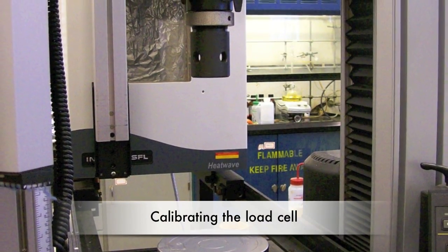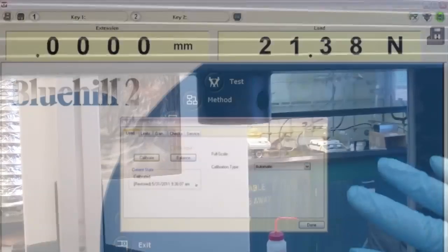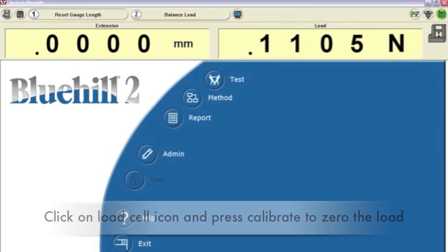Next, you need to calibrate the load cell. Remove any attachments so the load cell is freely hanging. In the software, click on the load cell icon in the upper right corner and press calibrate. This will zero the load. Click done when calibration is complete.